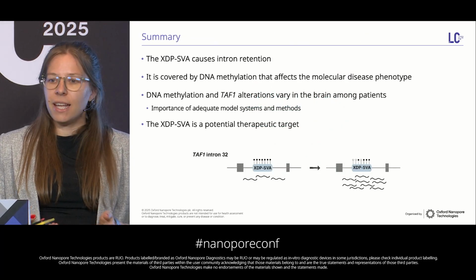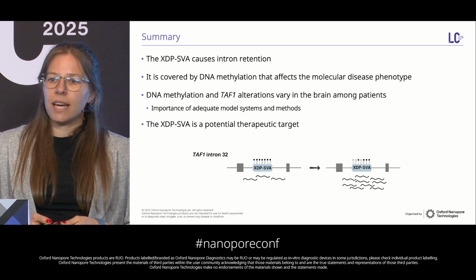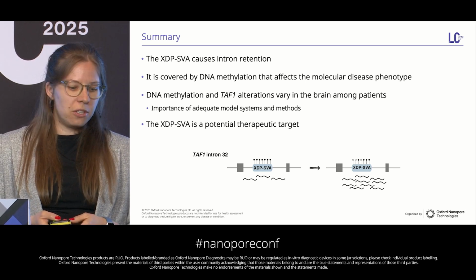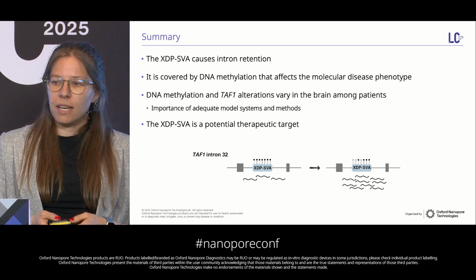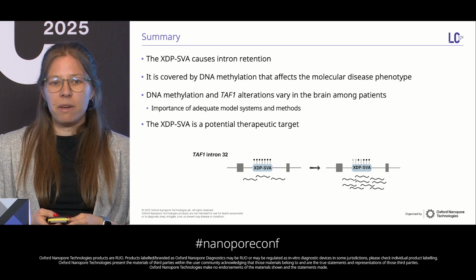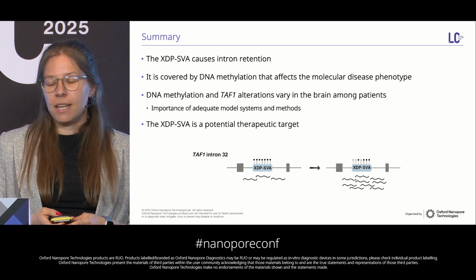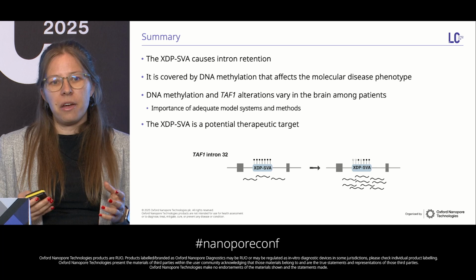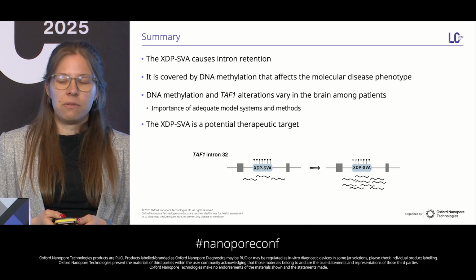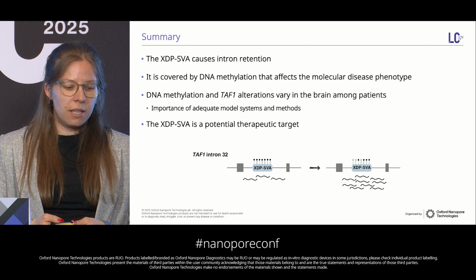And then with that, I just would like to summarize what I told you today. I showed you that this XDP-SVA causes intron retention, that it's covered in DNA methylation and H3K9 trimethylation, and that the presence of especially DNA methylation affects the molecular disease phenotype. DNA methylation and TAF1 alterations vary amongst patients, and it highlights very much the importance of using adequate models when studying brain disorders and adequate methods such as long-read sequencing.